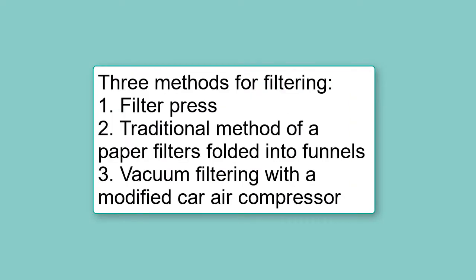There are different ways to filter the suspension shown in this video: using a filter press, using a traditional filter folded into a funnel, and using a vacuum pump made from a car tire air compressor.